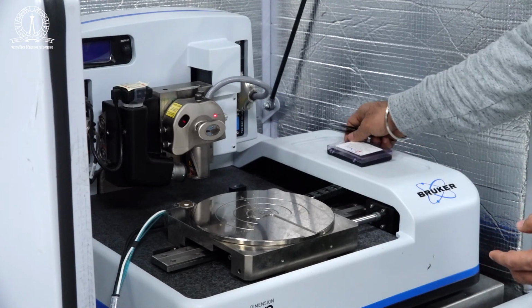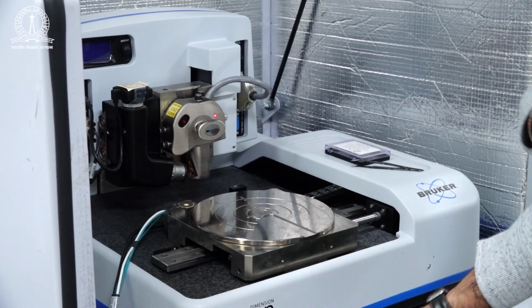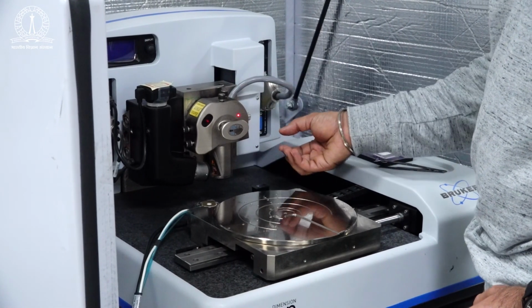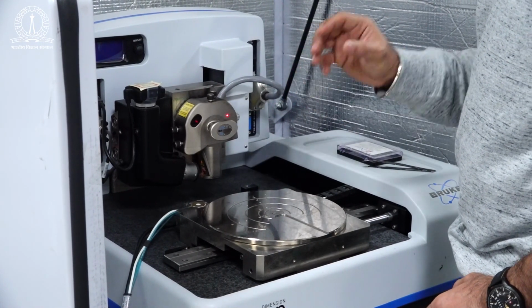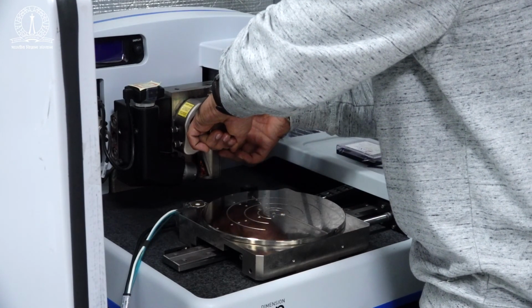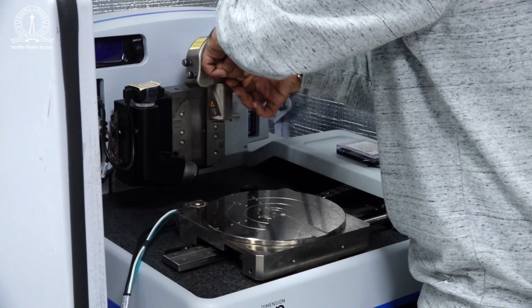Then again we need to remove the holder. That also needs to be done very carefully. Slowly.